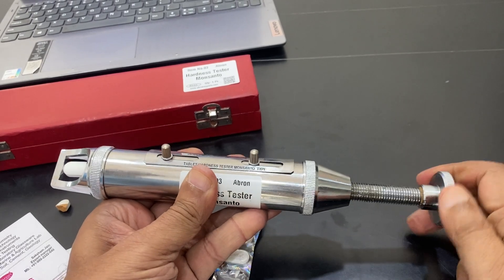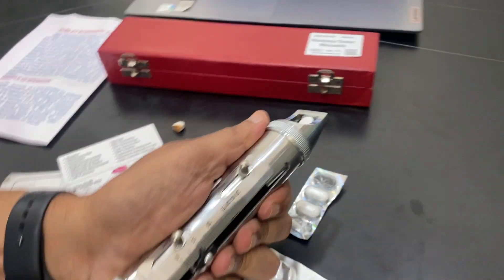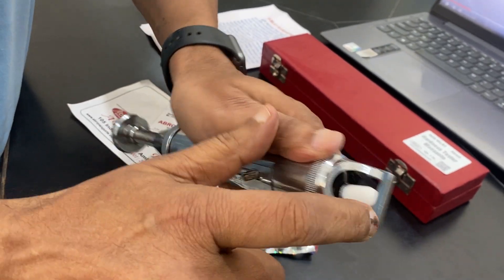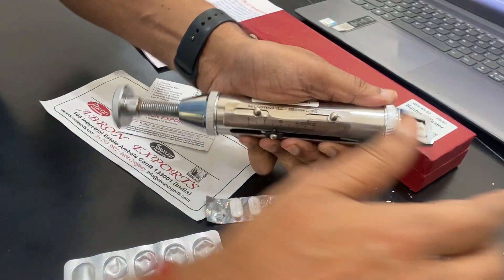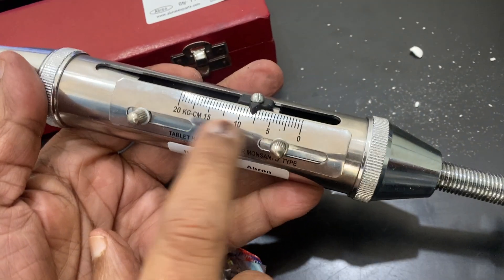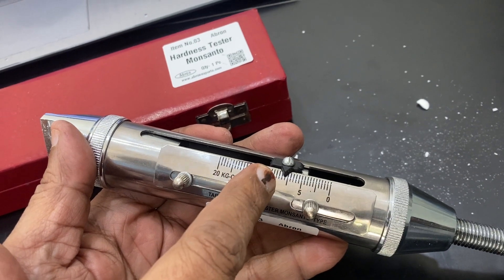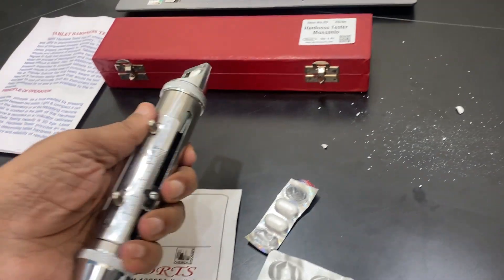At one point the tablet is going to break. It has a notch — it is not going to fall without breaking. Now this tablet has broken. I can see this is almost 11 kg per centimeter of pressure. We started at zero as the original reading, and this pressure is the LLO reading — the pressure reading.